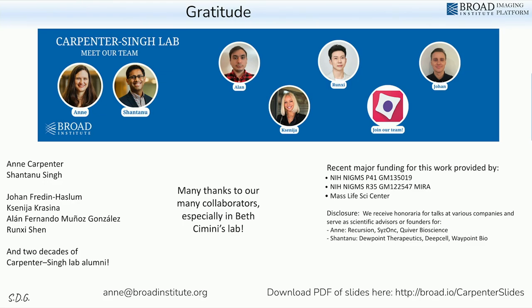And then on the academic side, we've seen a number of papers. I don't think we've yet seen a super convincing paper that has a large enough set of compounds or a big enough task to be really confident that bright field imaging is replacing 90%. Of course, we don't expect 100%, but is it even like 80 or 90%? We've seen some smaller scale experiments that look pretty promising, but I would hesitate to be conclusive, like, we don't need the dyes anymore, we can just use bright field.